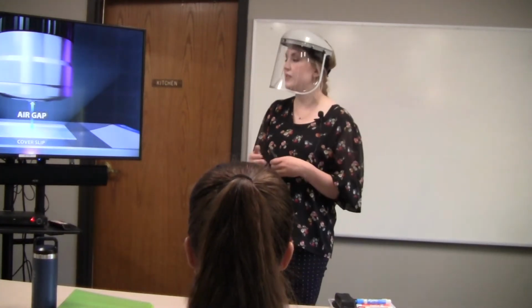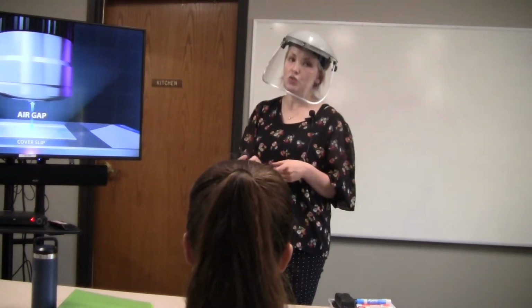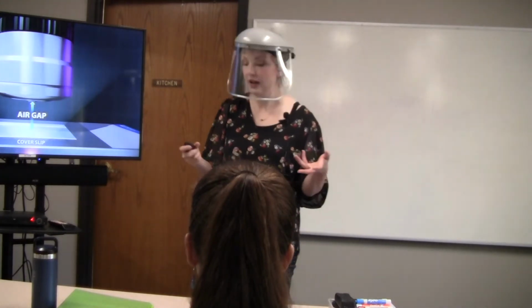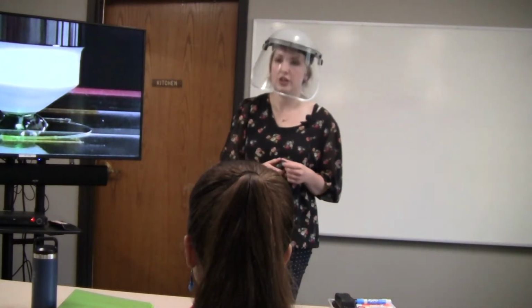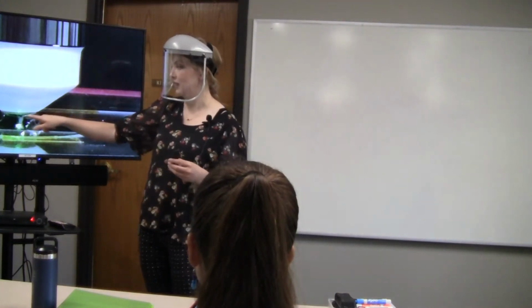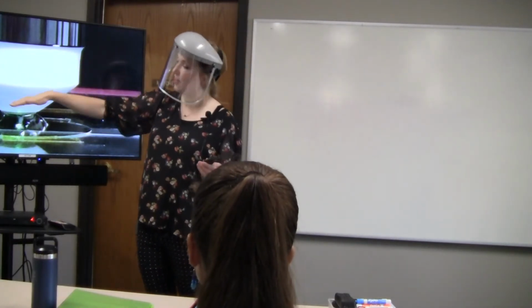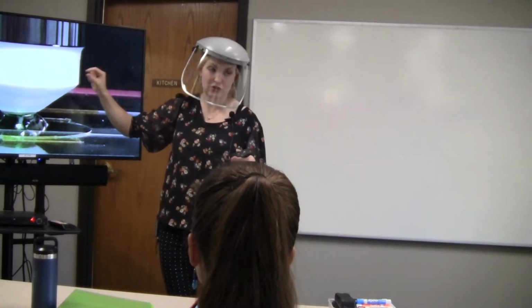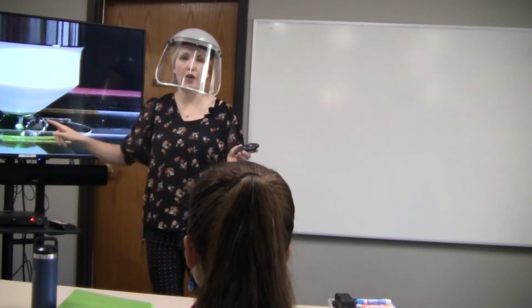That's not the case with all microscopes. In order to see the smallest things like bacteria, you actually use something called an oil immersion microscope. We don't have these; this would be if you take a microbiology class in college. You actually use oil on your slide and it touches the lens. It gets so close to the slide that it's making contact almost with the slide, so you have to be very careful, and you use a drop of oil.